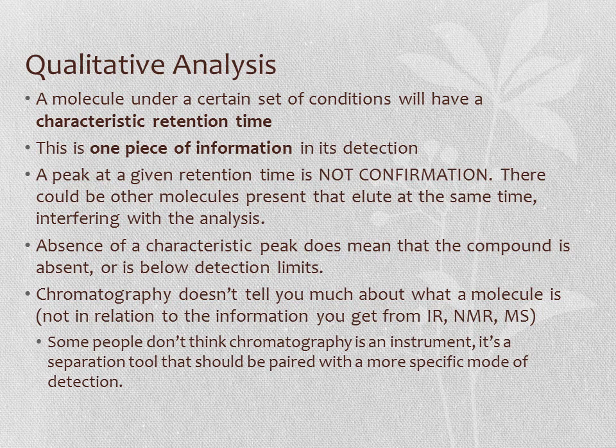Now what you need to realize is this is just one piece of information about that molecule. Having a peak at a given retention time is not confirmation that the molecule is there. You could have other things that elute at the same time and interfere with the analysis. But while having a peak is not confirmation of its existence, absence of a peak does mean the compound is absent, or rather is below the detection limits.